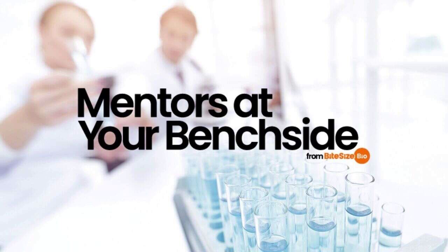In addition to applying these 3 tips to avoid measurement drift, it's also important to evaluate the performance of analytical balances by carrying out routine testing. This will help determine whether they need on-site modifications, repairs, or calibration. Problems can occur due to defective components or how users operate them. You should therefore test them for repeatability to ensure they're delivering accurate results consistently. Here are some tips for further testing measurement repeatability.